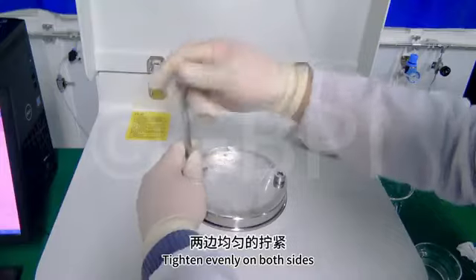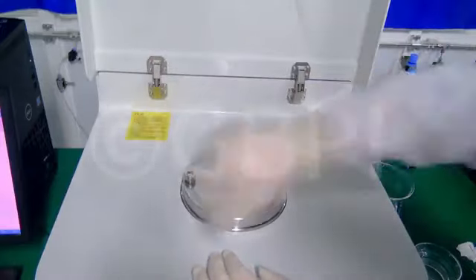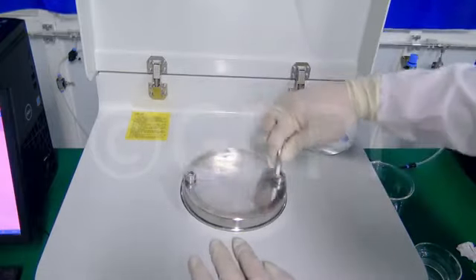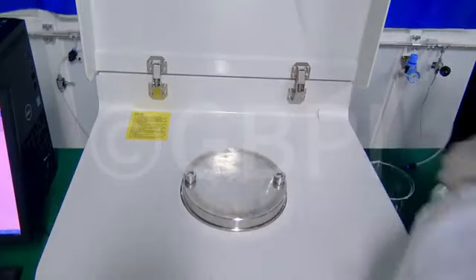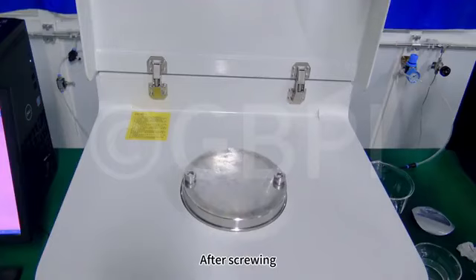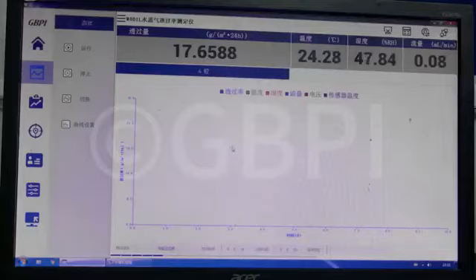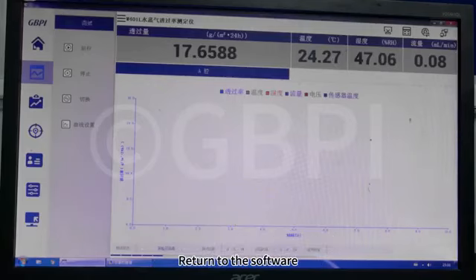Tighten evenly on both sides. After screwing, then we put the protective cover on. After applying the standard film, return to the software.